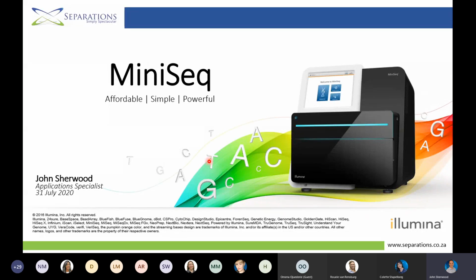I'd also like to let you know that we've tried to mix the content up a little bit so you don't see the same content over and over. But bear in mind, I'll mention throughout the presentation that a lot of the things you saw in Maria's presentation on the iSeq are also applicable to the MiniSeq, as well as to the MiSeq and the NextSeq. So the examples we're focusing on today are by no means everything the MiniSeq can do. It's actually a very versatile instrument.